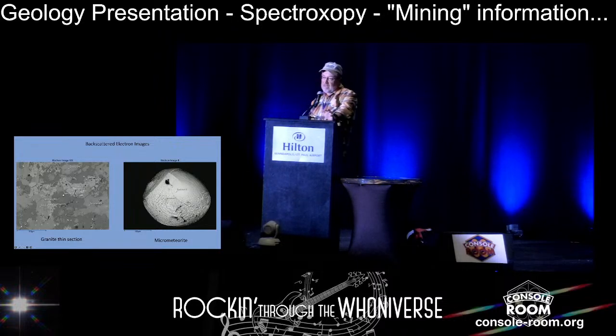The brightest things are typically going to be things like iron oxide. It could be minerals with heavier elements in them, like rare earth elements. There's a mineral called monazite that is quite bright. Zircons tend to be quite bright. And it's the little bright ones that are often the squirrel. Let's go check that out. And we get sidetracked pretty easy.